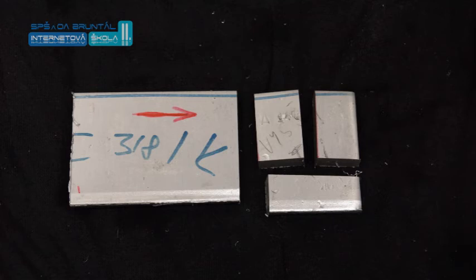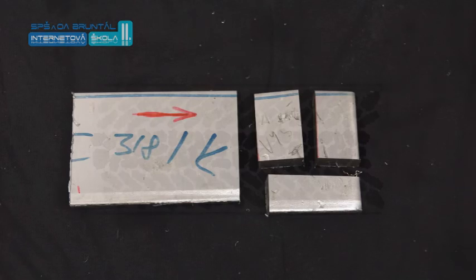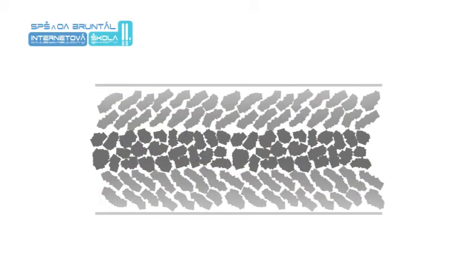In the next photograph we have an image of strips and these strips are cast using continuous casting. During continuous casting, due to roller movement, the strips cool and the crystalline structure is oriented against the direction of strip movement.